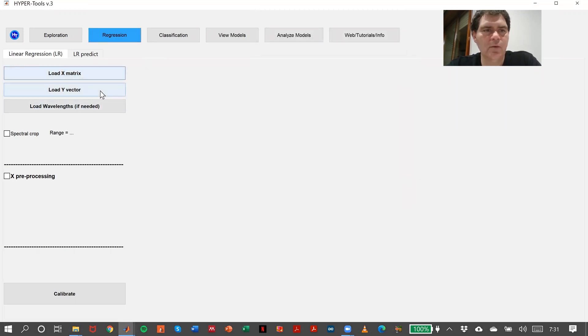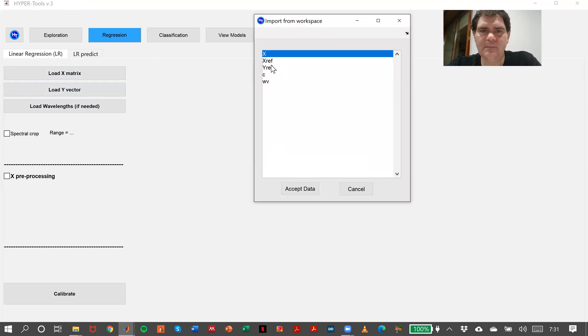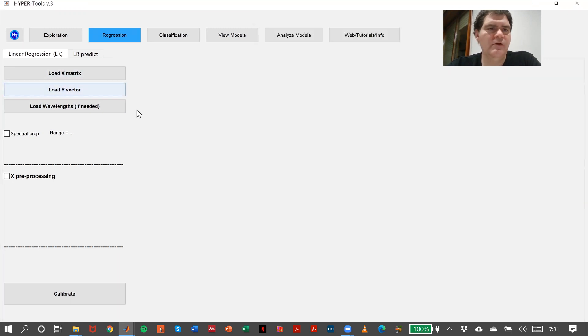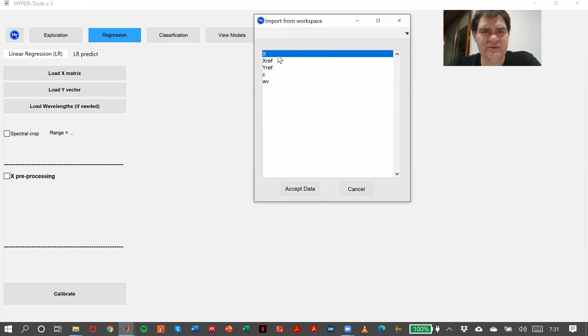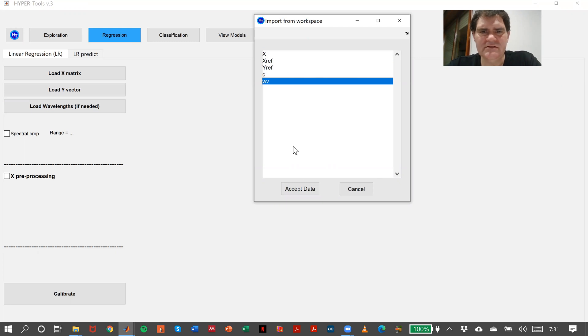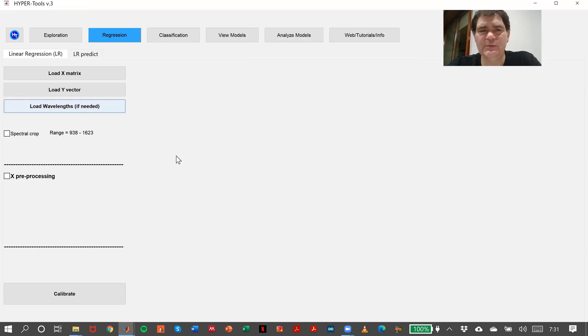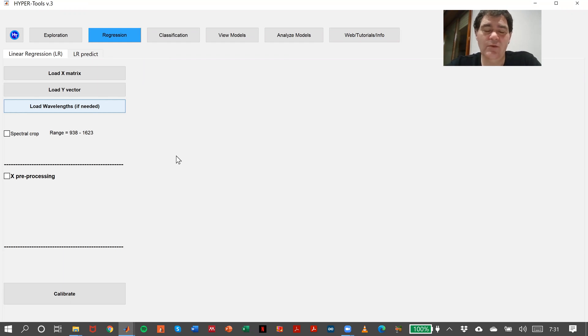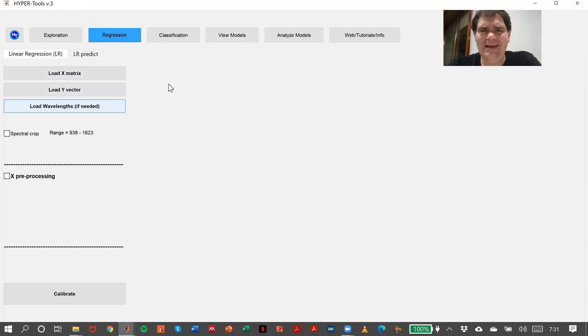Then Y vector, Yref, and the wavelength vector. As you can see, it's very similar to the classification tab. The only difference is we don't have the possibility of extracting from a standard image in our workspace because here we only use X matrices, and that's normally fine.